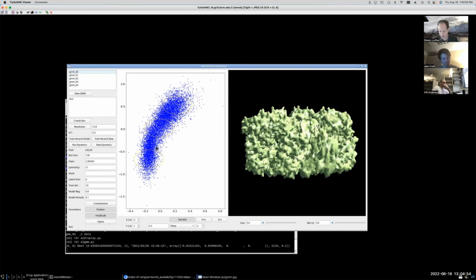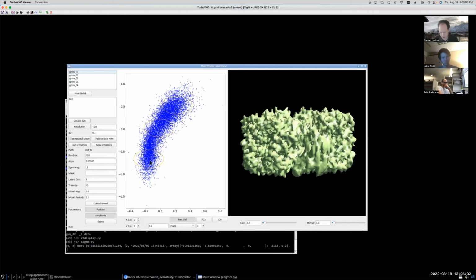Anyway, you can see here the results of GMM0. And you can see how it's spread out more. So this is going from about -1 to +1, and you can see a shape to it. This was done with 4 dimensions. So what I'm seeing here is just dimension 0 versus dimension 1.